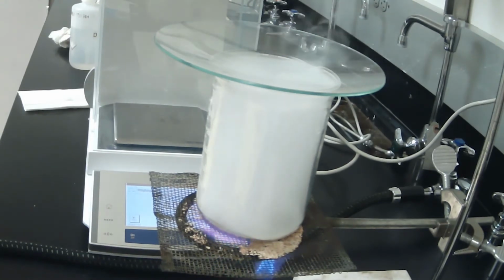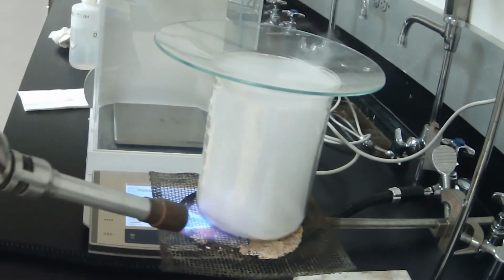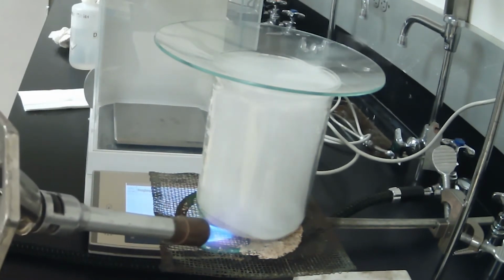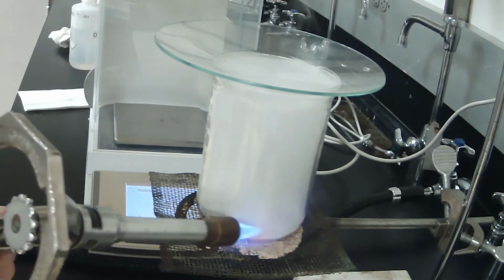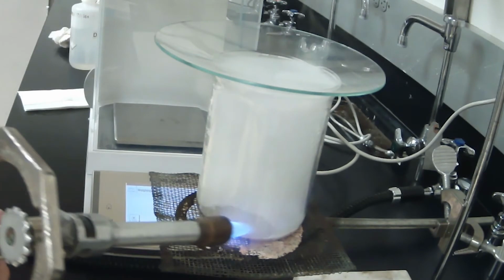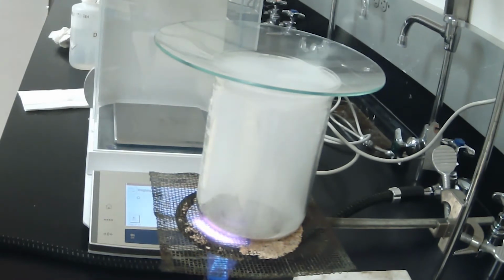And here is the important part of this lab. We have to make at least a 1-inch gap of clear glass around the bottom of the beaker. To illustrate what I mean by that, I'm going to hold the Bunsen burner now sideways. I'm going to put it right there on the glass. Glass is not a very good conductor of heat, but as I put it right there on the glass, I created basically a 1-inch gap of ammonium chloride. Now we're going to need a gap that large all the way around the entire beaker.